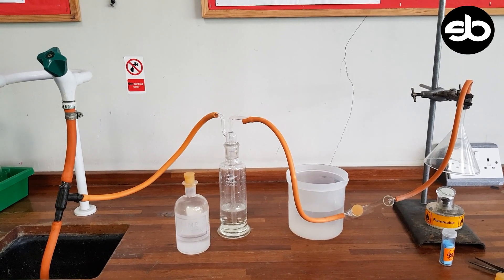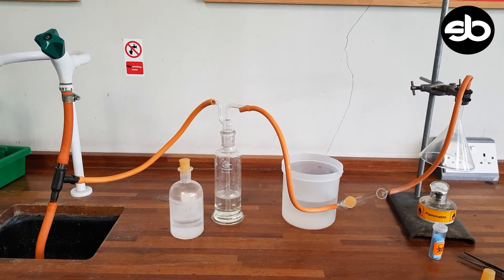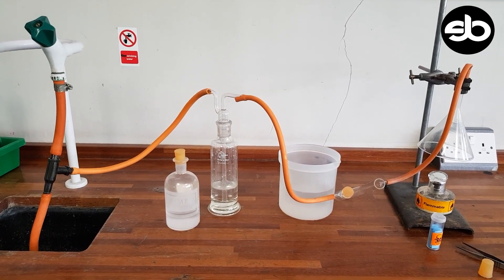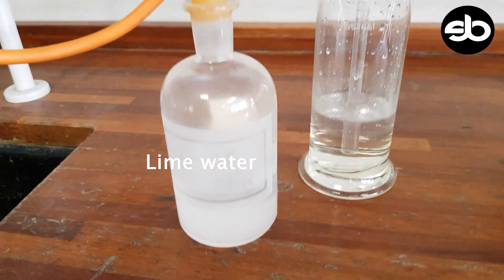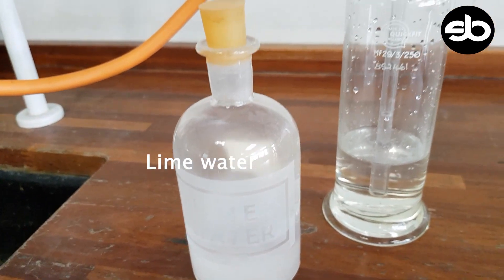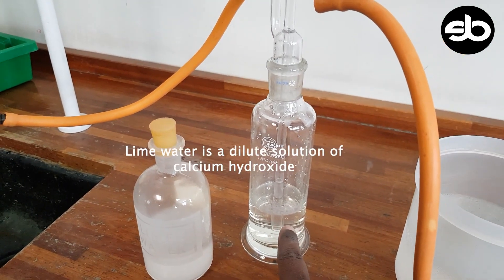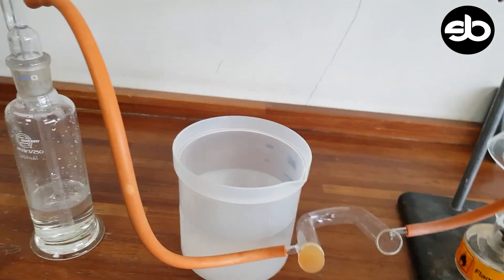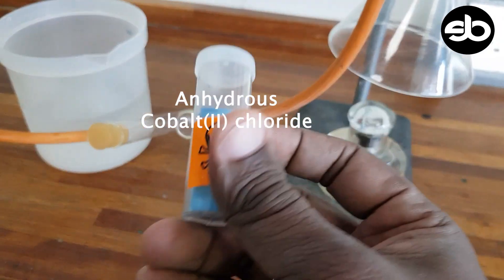In today's experiment we'll be looking at how to test for both carbon dioxide and water. For the carbon dioxide we'll be using lime water, which I have already put in here as you can see. To test for the water we will be using cobalt chloride.